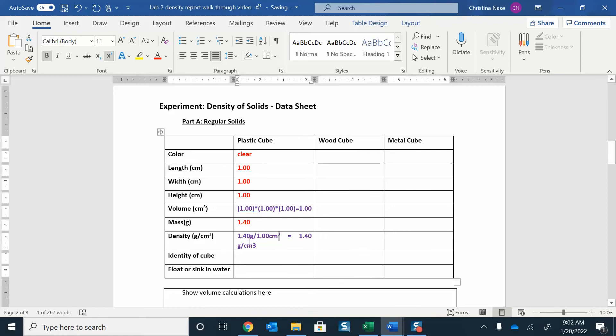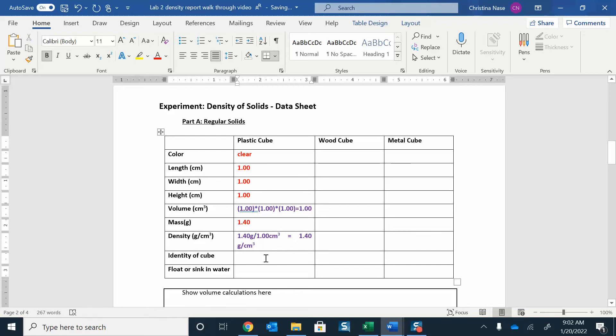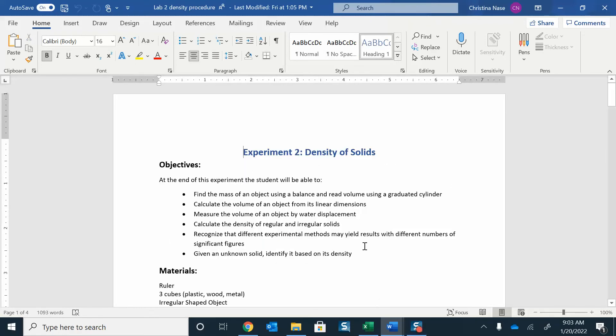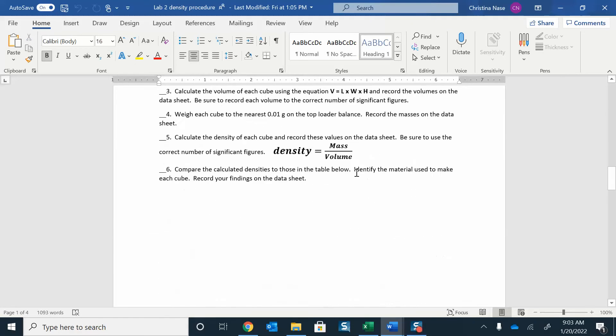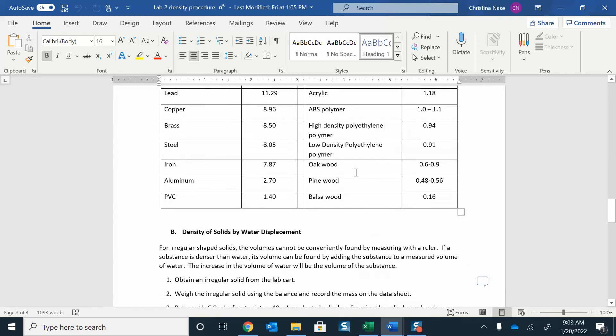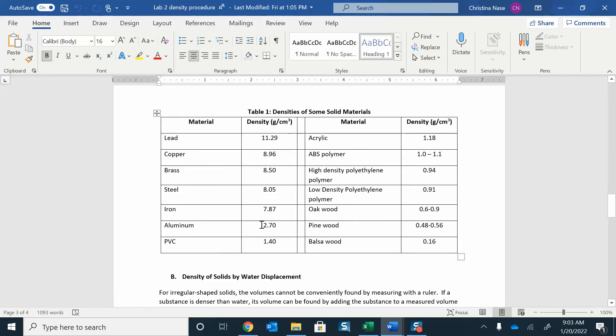Alright, so that's my volume. Then you want to identify this. You're going to use the chart in the lab manual to help you figure out what cube you have. If you open up the lab manual, Experiment 2, scroll down to the bottom, and there is a chart here that has some common materials.